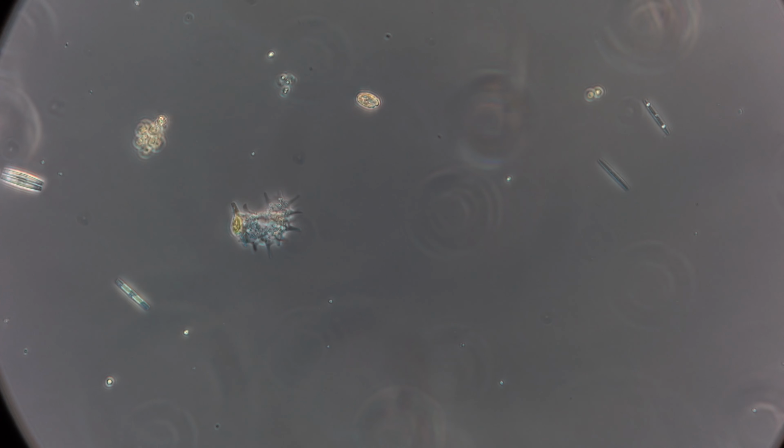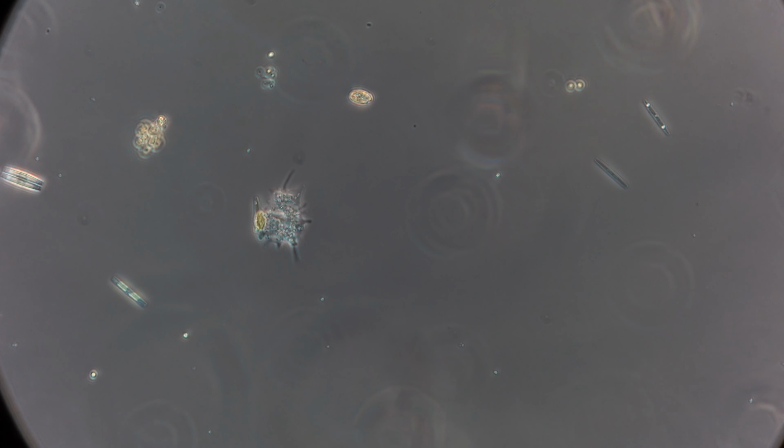This is okay. You can see the amoeba and all its pseudopods. So I just take a photo basically. It's so fun watching its insides slowly tendriling out. Imagine if you could be an amoeba and that's how you interface with the world. It's like our white blood cells. It uses actin and microtubules to polymerize and depolymerize and push the cell membrane, like how our cells move, but they move faster, similar to white blood cells.